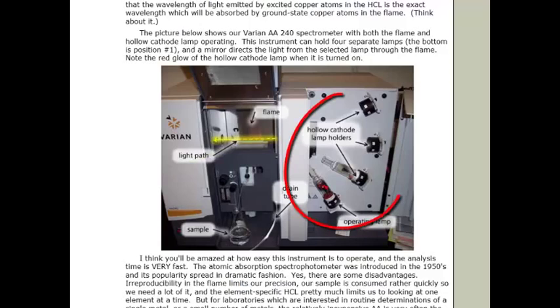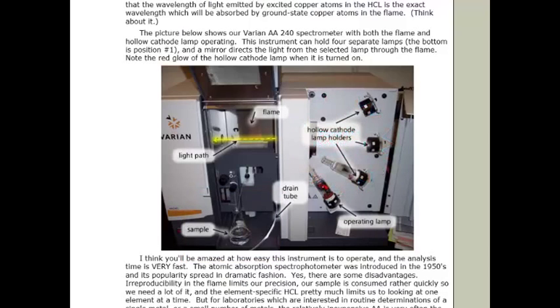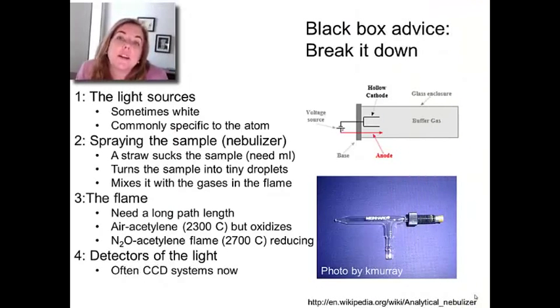Over on the right you can see the cathode lamps, and you can switch between them. Each lamp is designed for a particular element. The reason they shine at a certain wavelength is because that element is inside it. For example, this copper lamp is emitting the wavelengths that copper atoms absorb. You can only use one HCL lamp at a time. When you buy an atomic absorption spectrometer, you outfit it with a series of lamps that define what elements you can measure. The other drag is the sample—you need a lot of volume. It's a very noisy instrument, and you sometimes have to average and take the sample through the flame for a while. It's not just like taking a picture.